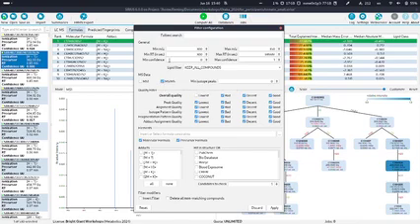Just to go through everything a little bit at least, here you can select MZ ranges, retention time ranges, but also confidence score ranges. For example, if you're only interested in compounds where we are very confident on the predictions, you can select that. There are also settings for your MS data, the quality settings I talked about already. Also here you can filter by specific elements, by molecular formula, precursor formula. You can also select some adducts for the filtering, and you can select the structure database. I also showed this a little bit. Okay, let's apply this filter.